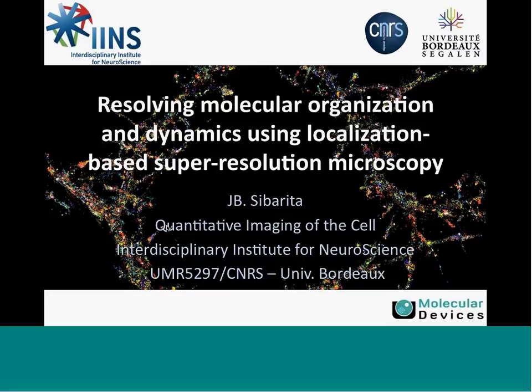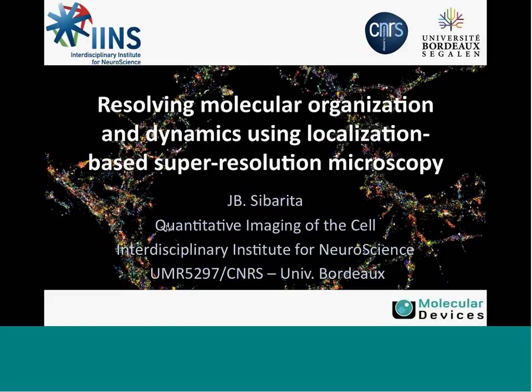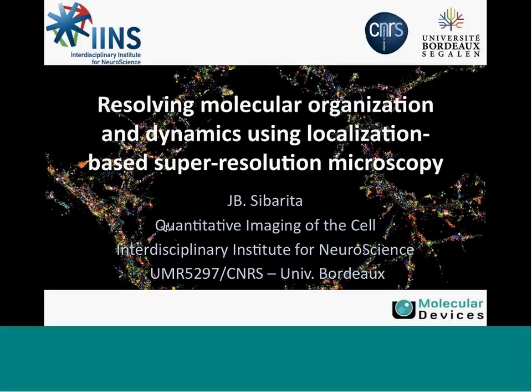In the second part, I will go into some technical implementations that we have done, related to this technology transfer with Metamorph, and try to present how we have overcome some of the limits due to the heaviness of the technique, the time-consuming resources required for this localization technique, and how we ended up with a software which allows super-resolution in real time.